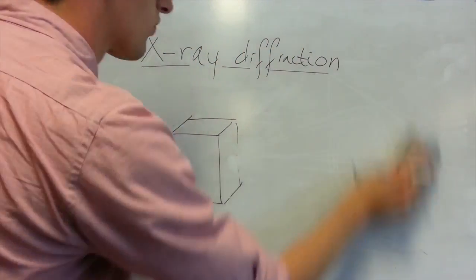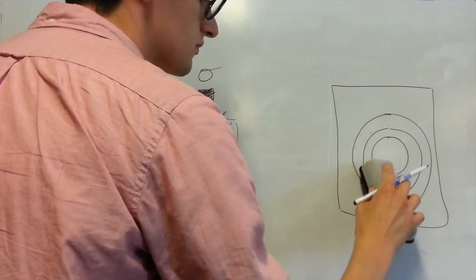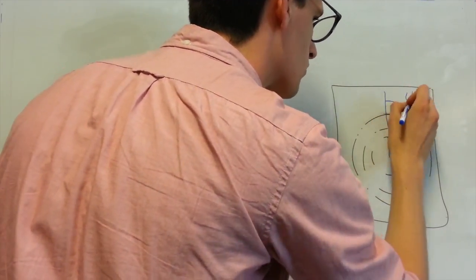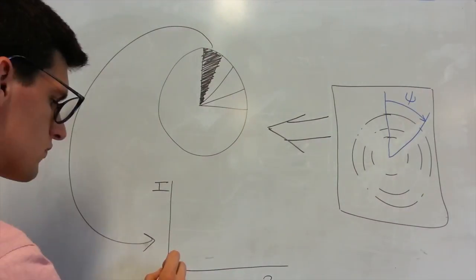If the crystals are somehow preferentially oriented, say due to some external electric field or applied stress, then this once neat circle will be ruptured by variations in intensity. Because of this dependence on the angle psi, the diffraction image is sliced into cakes at different angles and summed across each cake to give a linear profile that is then ready for analysis.